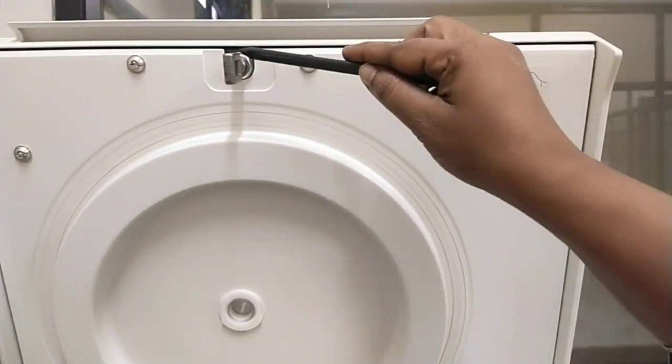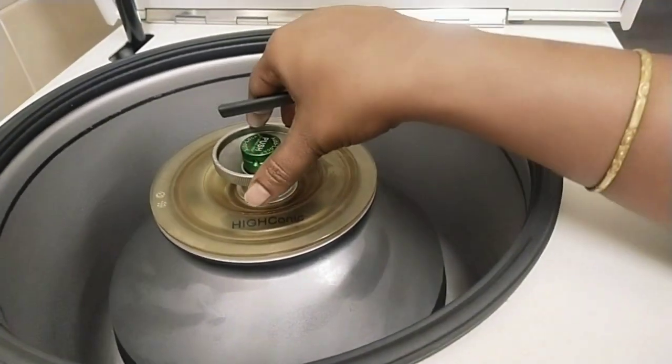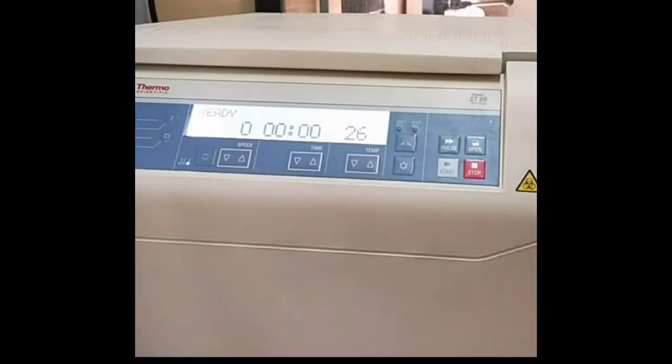This is the lid and lid hook. The rotor holds 6 microtubes, which can be placed at a time in the equipment. When the power is on, the display shows the speed and time as 0, and the current temperature inside the rotor chamber is displayed.